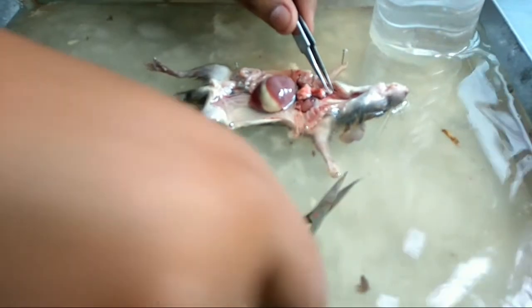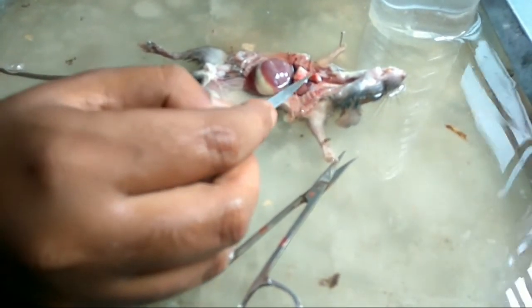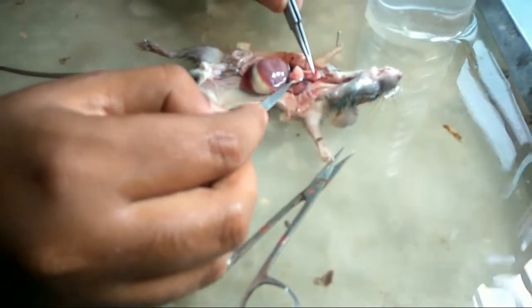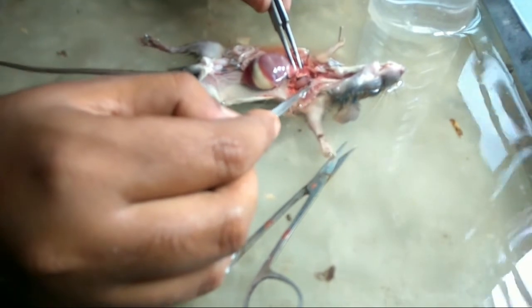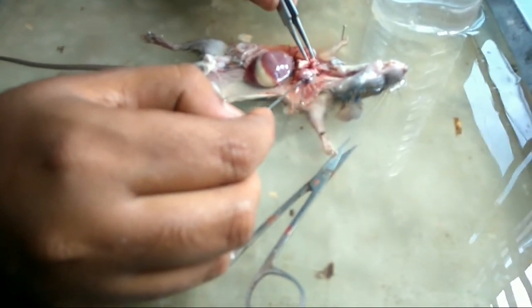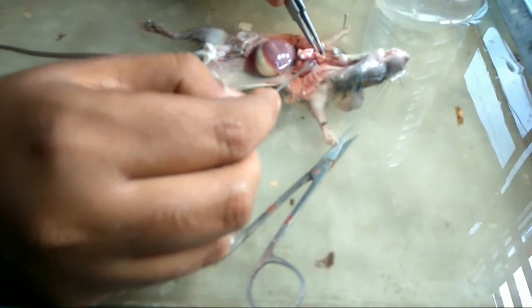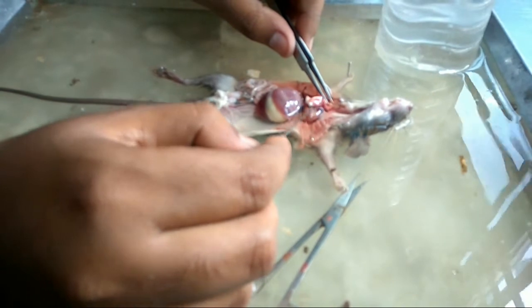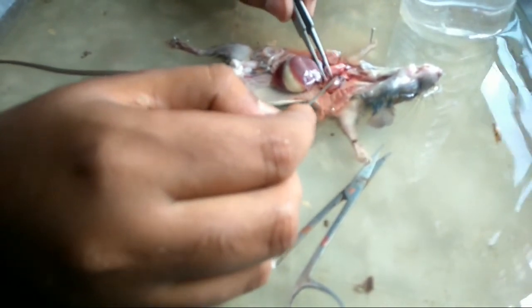Now make a cut here to open the trachea. Below the lungs you can find the heart. This is the ventricle, and just above the ventricle you can find some reddish chambers which are the auricles — reddish in color — and these are the ventricles.